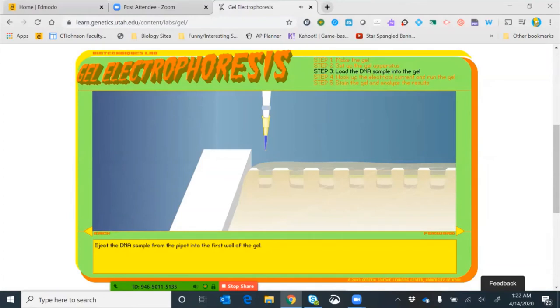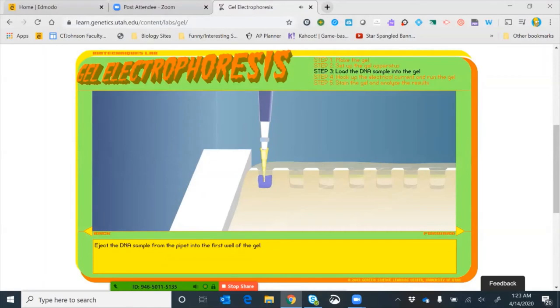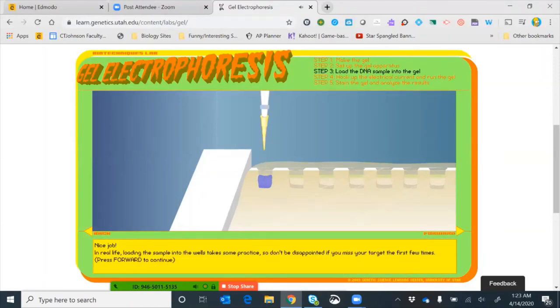The wells are very small and clear — loading them is the most stressful part of this lab. You carefully go just into the well: don't go too deep or you'll poke the gel and lose your sample; don't stay too outside or the DNA will spread to other wells. Once you release the liquid, pull the pipette tip out immediately. Some students get excited, release the sample, but then leave the tip in and let go of the plunger, sucking the sample right back up. In real life this takes practice, but in the virtual lab — no issues.